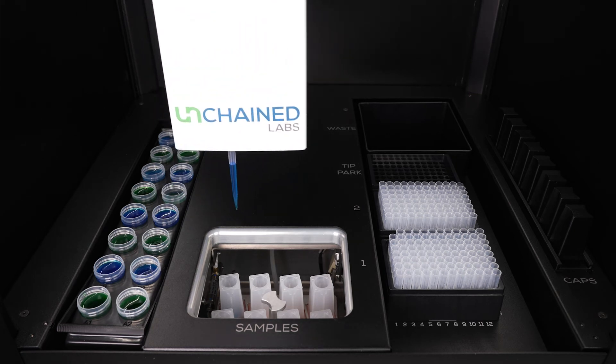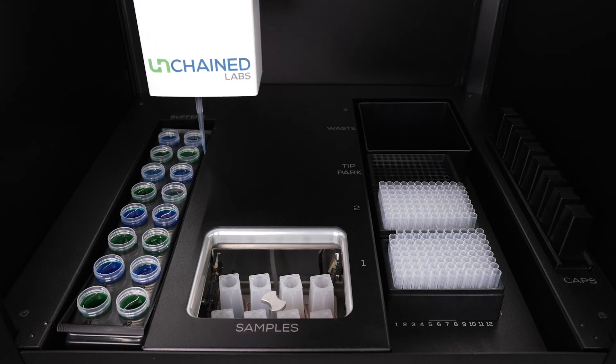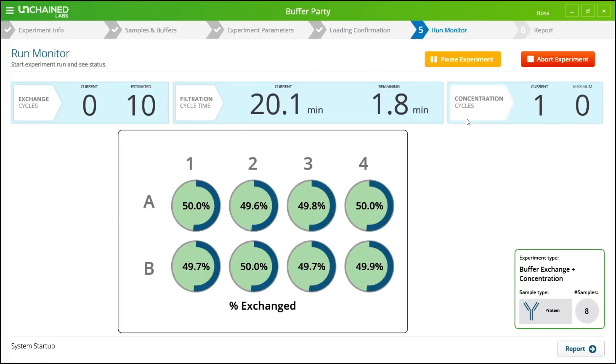During your run, you can walk away and grab a snack, but you can always stop by and check on Unagi's progress. You'll get a constant display of exactly where each sample is in its exchange and concentration cycles. Unagi loves to keep you in the loop and will shoot you a text message when your run is complete.